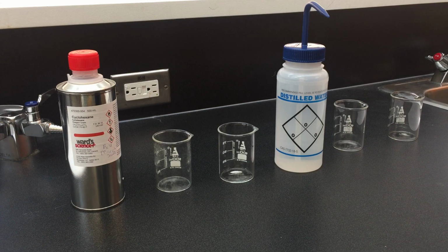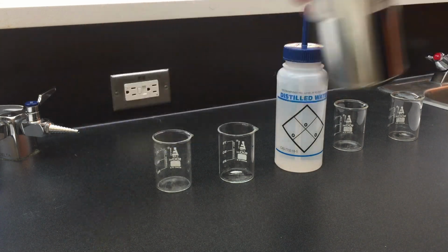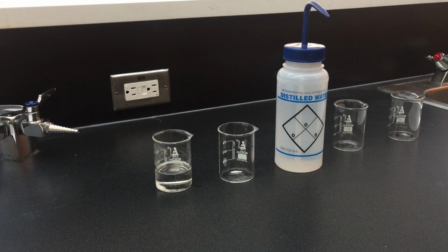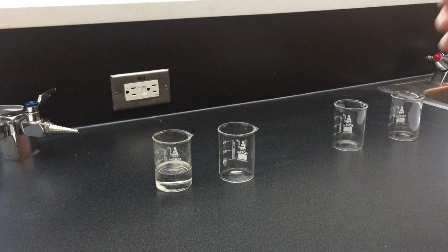All right, today we're going to make some nylon from an amine and an acid, specifically a diamine and a diacid. My two reagents need to be dissolved in two different solvents. The first solvent I'm going to be using is cyclohexane, which is an organic, clear colorless solution, looks just like water. And my other solvent will be water.